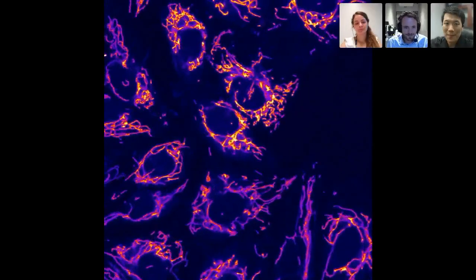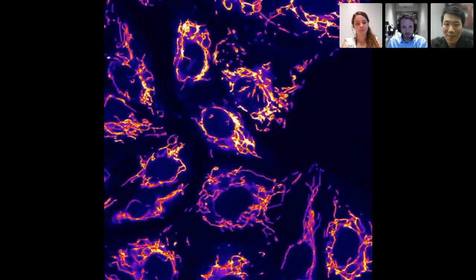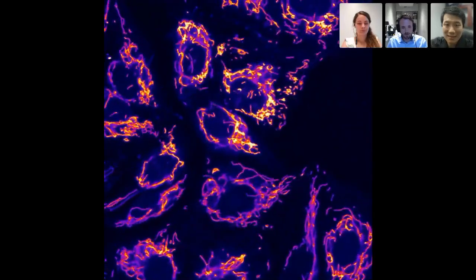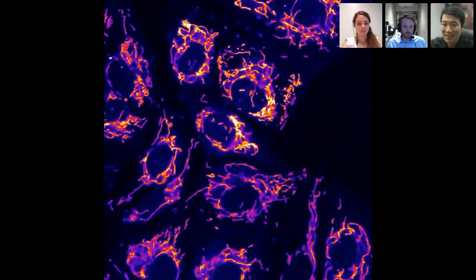So Jeroen, why not show a movie you took before, the very long stretch of mitochondrial movie? I can show that here. Let me know if that's visible to you. So this was done on the same cell type, but using RCM. And RCM improves the resolution further than what NL5 does. So we get a resolution that is very similar to a Hessian sim, but with a very low laser intensity.